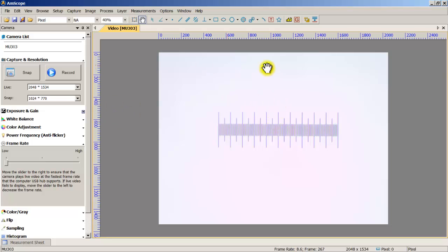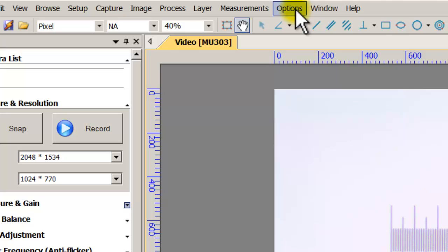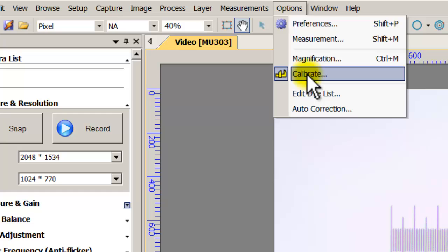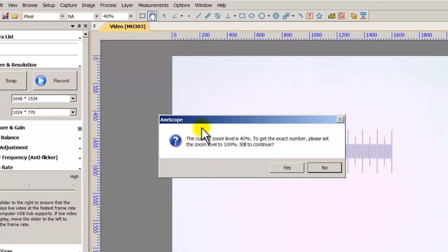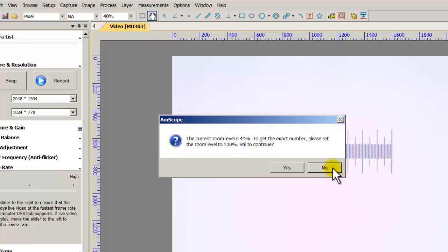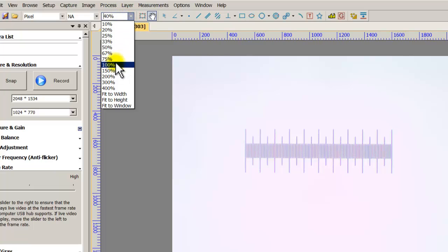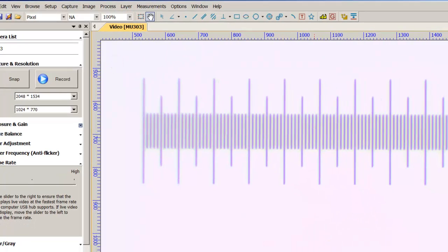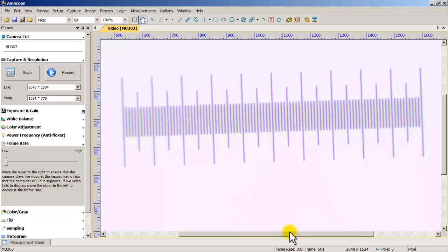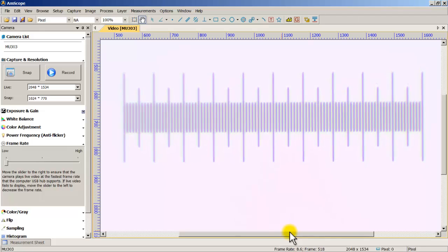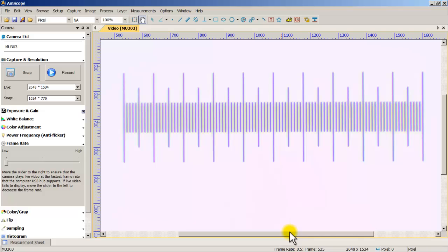After all settings are complete, go back to Options and click Calibrate. A warning appeared saying the current zoom level is set to 40 — to get the exact number, set the zoom level to 100. So I'm going to change it back to 100%. I'm zoomed in and it's a bit out of focus, so let me readjust focus. That's a little bit better now.